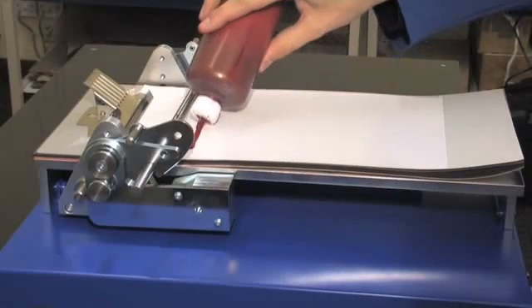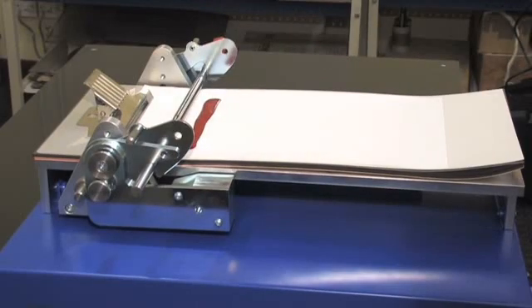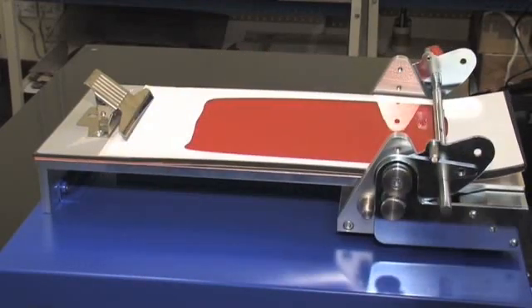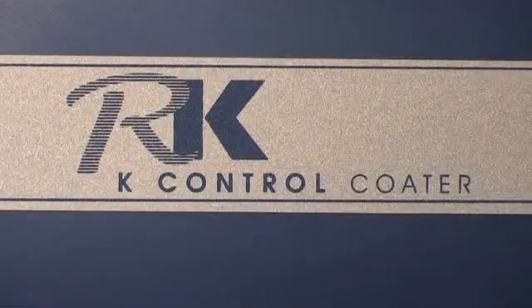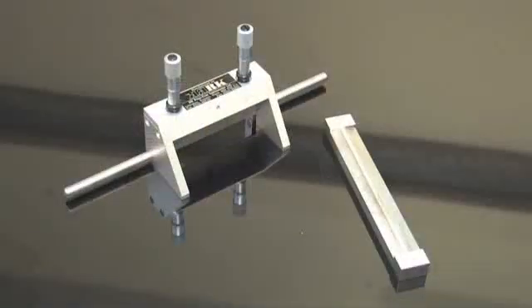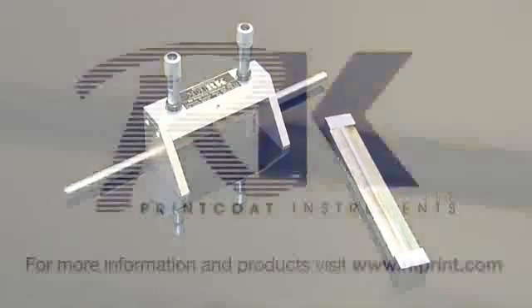Cleaning of K-Bars is easy and quick. Samples can be repeated flawlessly on even difficult substrates including polythene and foil. It's also available with a variety of applicators, including the bird and the micrometer adjustable applicator.